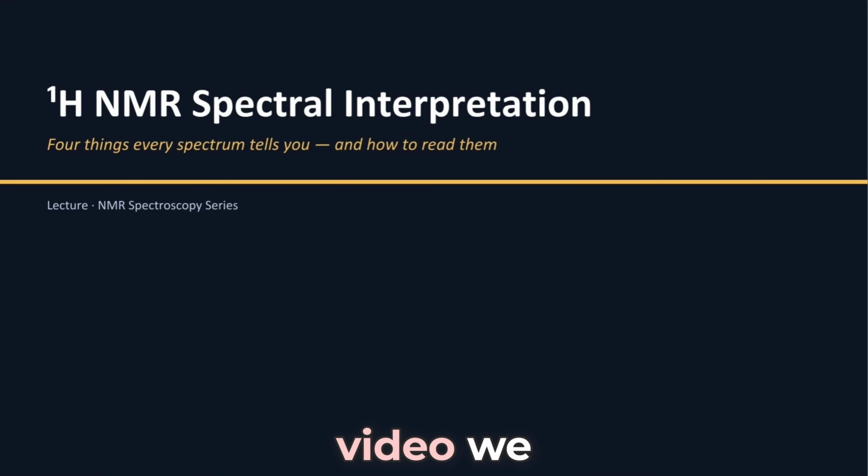In the previous video, we discussed something very important, which is impurities and residual solvent peaks in NMR. And I hope now, whenever you look at a spectrum, you are able to identify and ignore those extra signals. So now the real question is, what do we do next? All right, let's move forward.